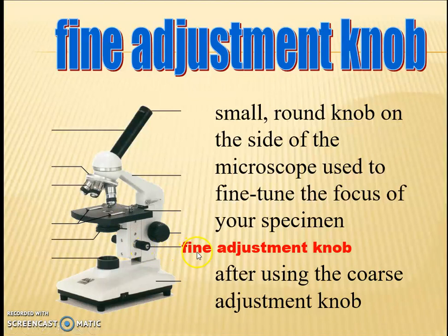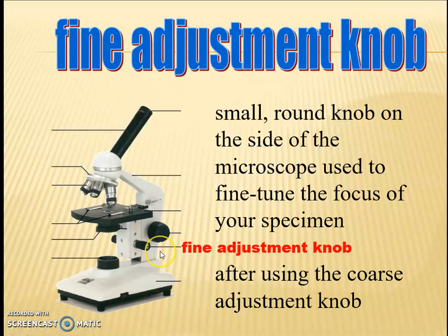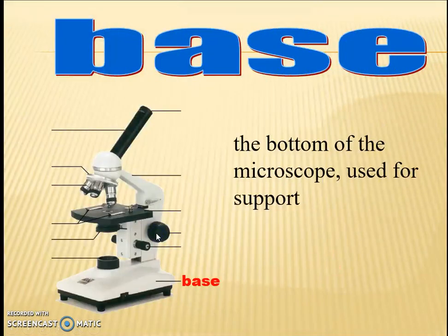The fine adjustment knobs are the small round knobs on the side of the microscope used to fine-tune the focus of your specimen. After using the coarse adjustment knob to get close to focus, you use the fine adjustment knob to fine-tune it.